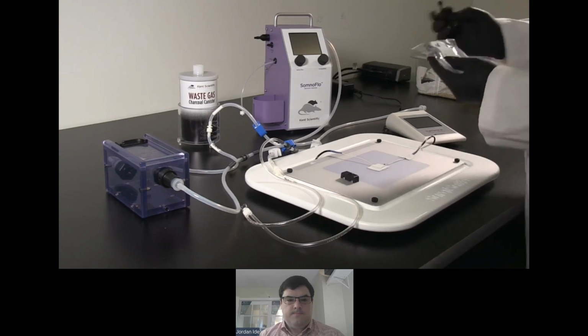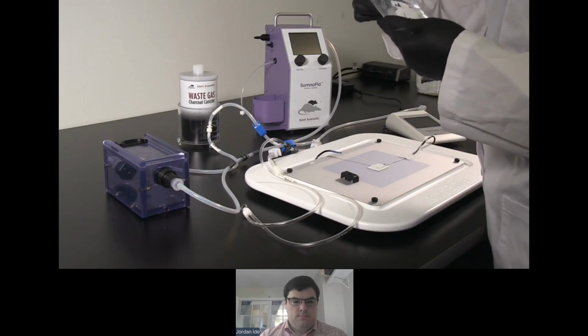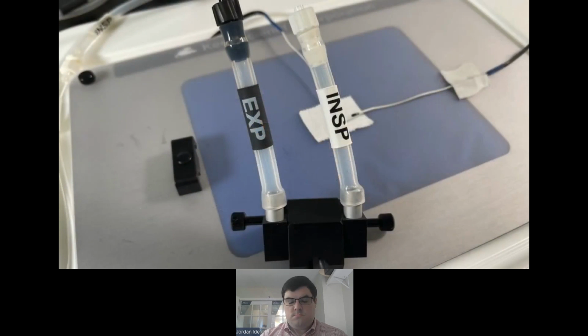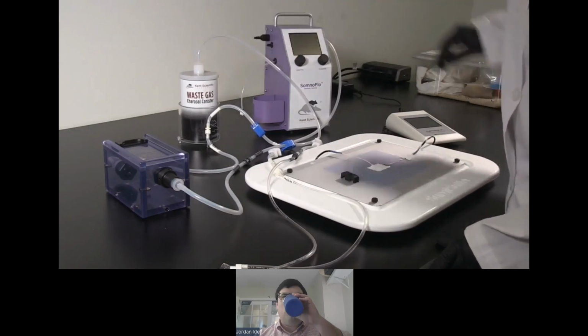If using a stereotaxic frame, select one of the included stereotaxic adapters to attach to the two accessory connectors on the ports of your stereotaxic gas anesthesia mask. Attach the charcoal canister using the charcoal canister tubing.